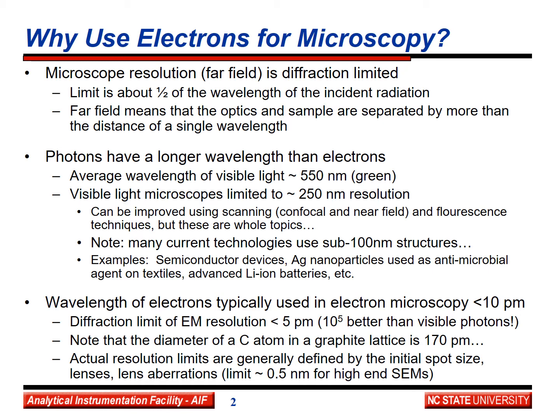You can improve this using scanning and fluorescence techniques, but these are whole topics in and of themselves. And since many current technologies use sub-100 nanometer structures, we have to be able to observe those with better resolution than what we can currently achieve with a visible light microscope.